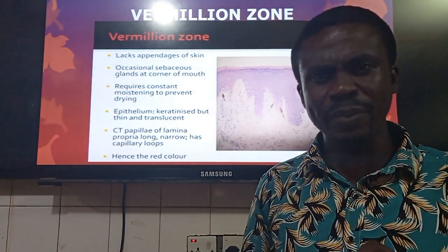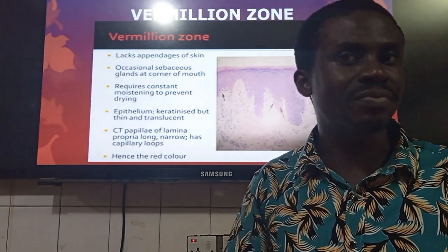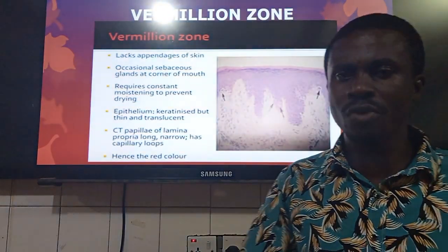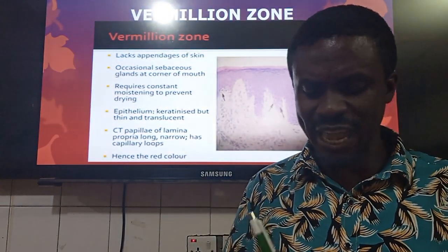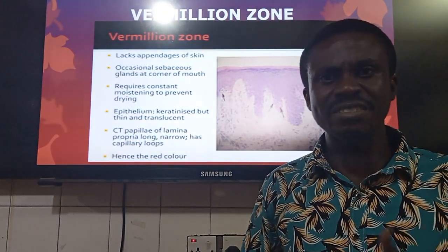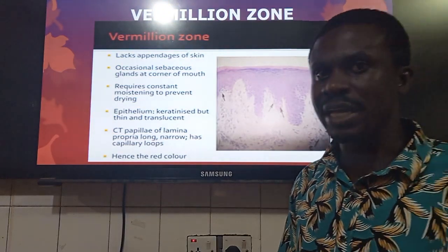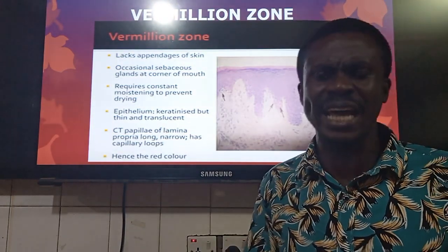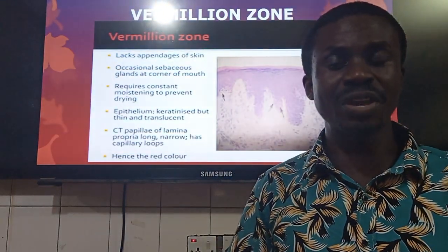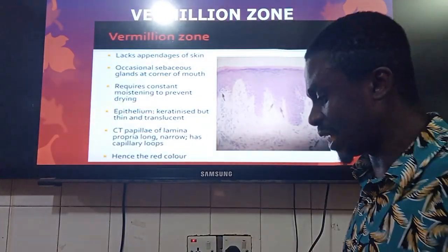And that is sebaceous glands which we find over there. Normally we want to see sebaceous glands with the skin. But we find sebaceous glands in the inner oral surface of the cheek. And because it's ectopic, you don't expect to find it over there. My friends, it is given an eponym, something we call Fordyce granules or Fordyce spots. So you may see that one also, because forming the core of the cheek will also be skeletal muscle fibers. And my friend, that is something we call the buccinator muscle.